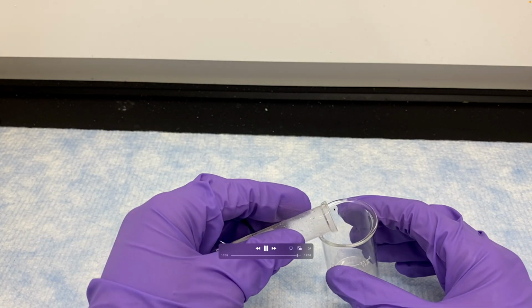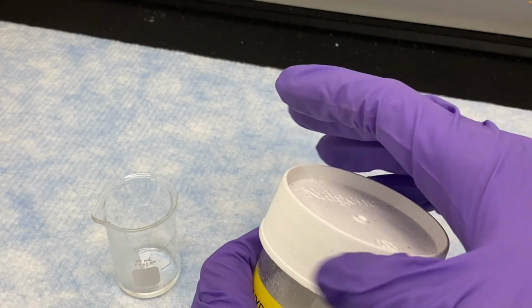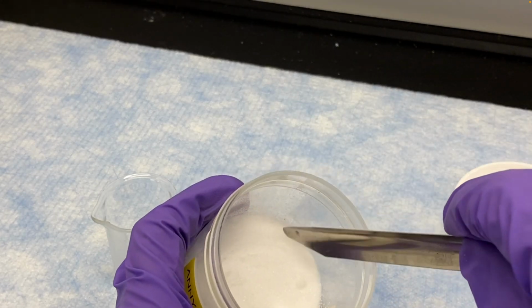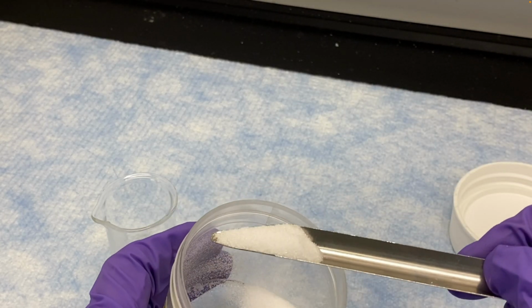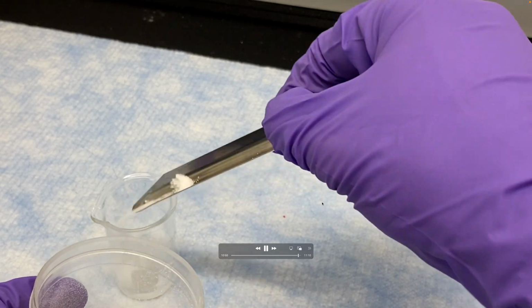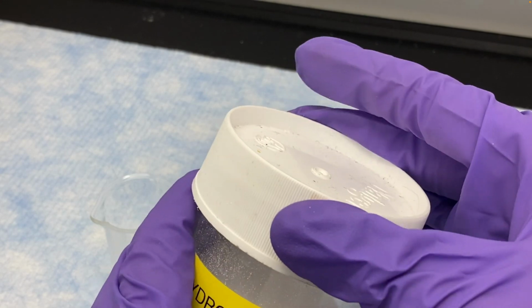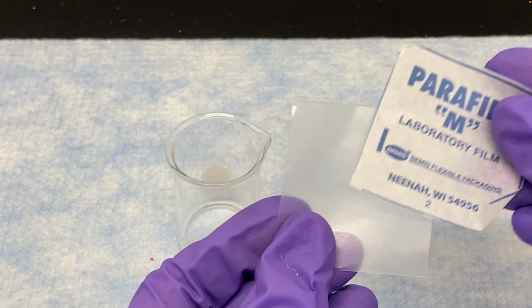So we'll take a heaping scoop of sodium sulfate. You'll pour your mixture of the ethyl acetate with camphor into a beaker where it's easy to scoop some anhydrous sodium sulfate, and we'll take a heaping scoop. A heaping scoop is a scoop that goes above the level of the container that's holding it. So you'll just pour that in. You'll know you've added enough sodium sulfate because there will be some that does not clump. When sodium sulfate is all wet, it's clumped. So if there's some that isn't clumped, that means all the water's been soaked up.